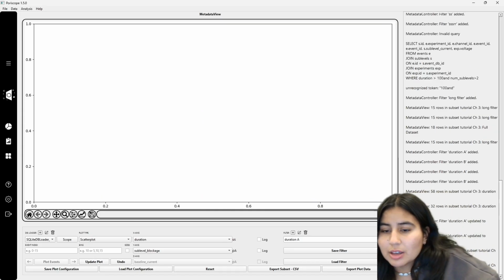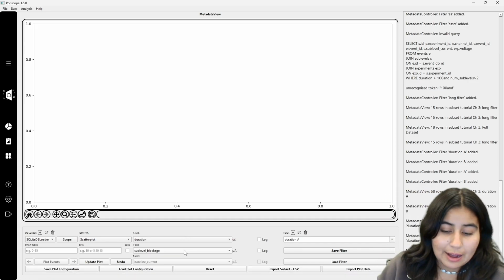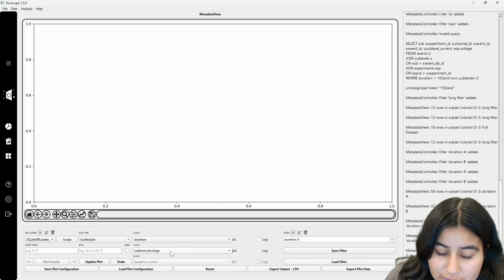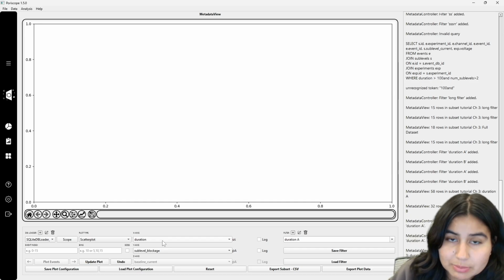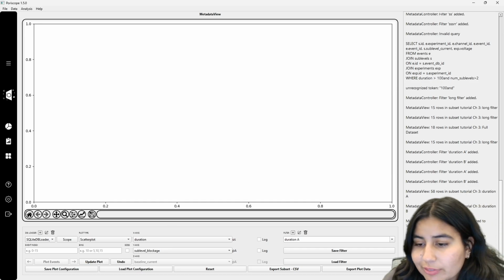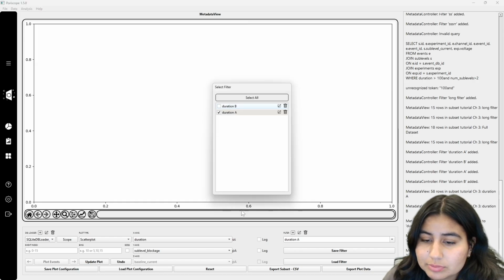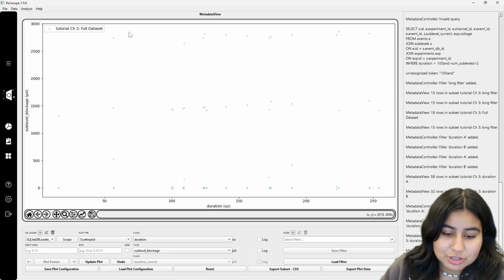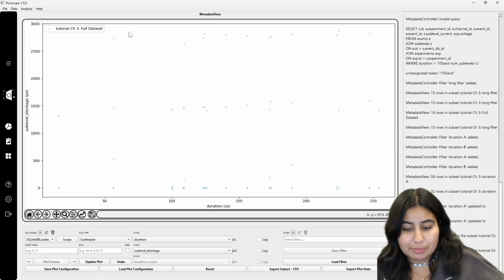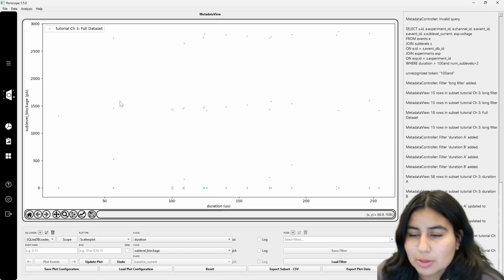There's nothing, because before we were doing duration against sub-level blockage, and duration is matching. Sub-level blockage has n levels, which was 3, and duration was matching each sub-level. But now that we're filtering for something that has less than 2, aka 1, it doesn't apply, so we're seeing nothing. We enabled this 1, 2, 3, because as I mentioned, event duration is going to be repeated n times for an event with n sublevels. So just something to keep in mind.